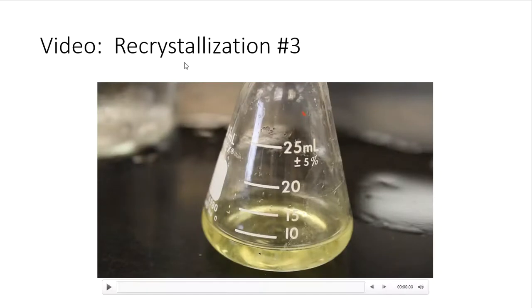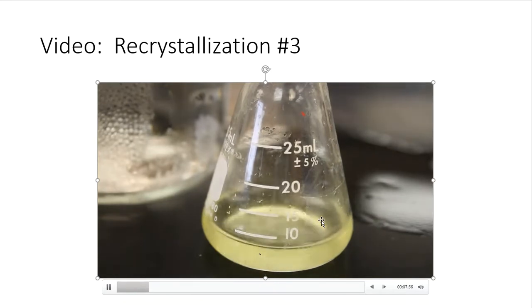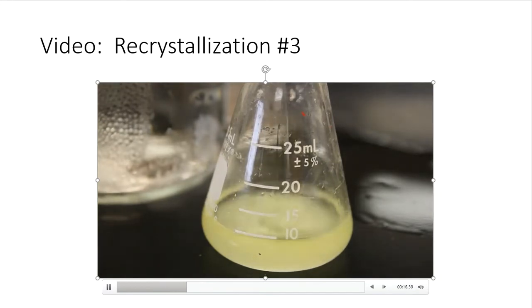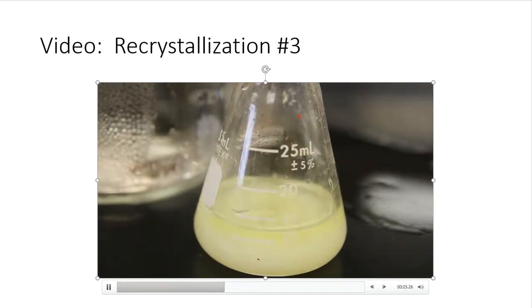And then finally, here is recrystallization number 3 for the methyl benzoate. That's it starting out, getting ready to add some cold water, and you tell me what happens, observations on your bench. Oh, did you see that? Did you see that? Something's happening.